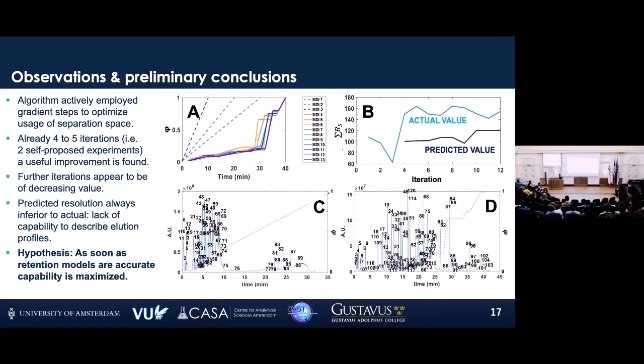But what is really important, also if you look over here, is that this distance, right, this is a complete waste. So at some point, once all these analytes have eluted, the method suddenly steeply goes up to get the last one next to it. And this is basically an example that's for me now easy to show to you of how that works.